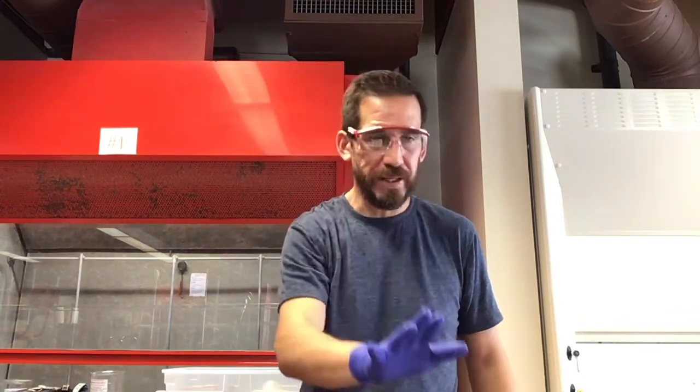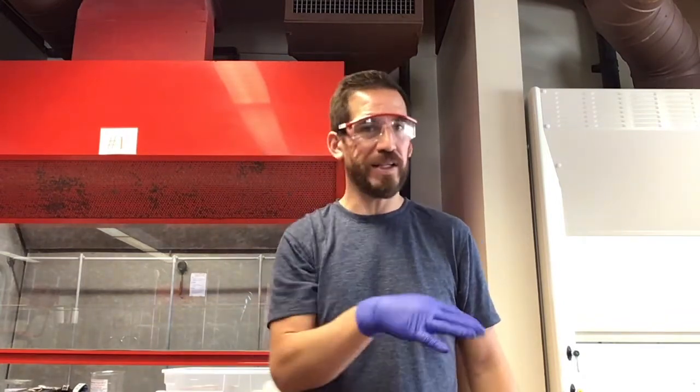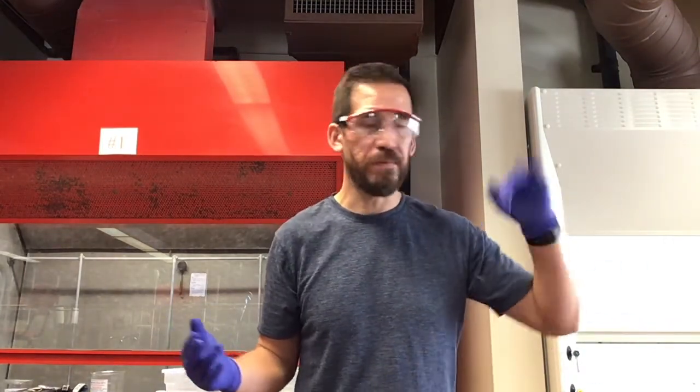There's a little bit of water that's going to be in here, and the ethanol. It is supposed to be absolute ethanol, but what I'm getting at is I'm going to clean these, and I'm not going to get too crazy about drying them. I'm just going to wash them, flip them upside down, and then do some other stuff real quick, and then be on my way. Okay, just to be able to move quickly.